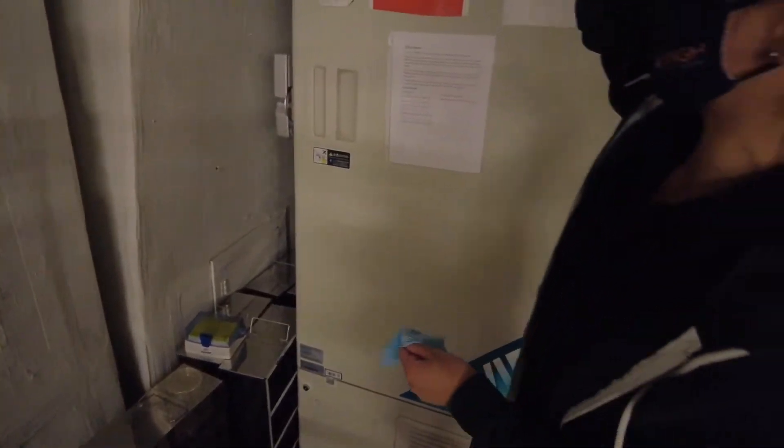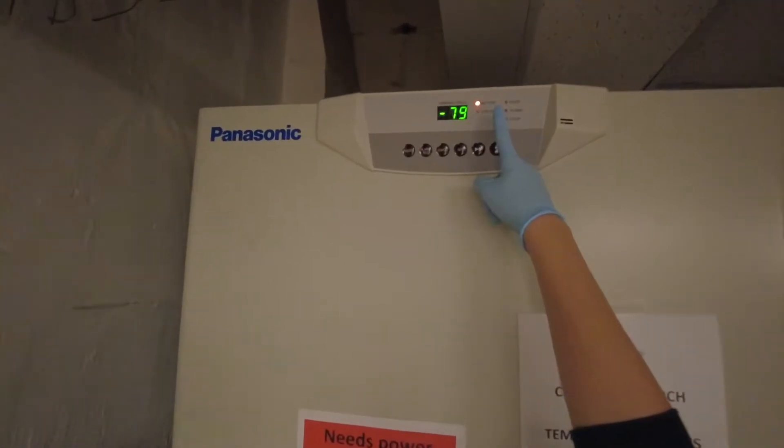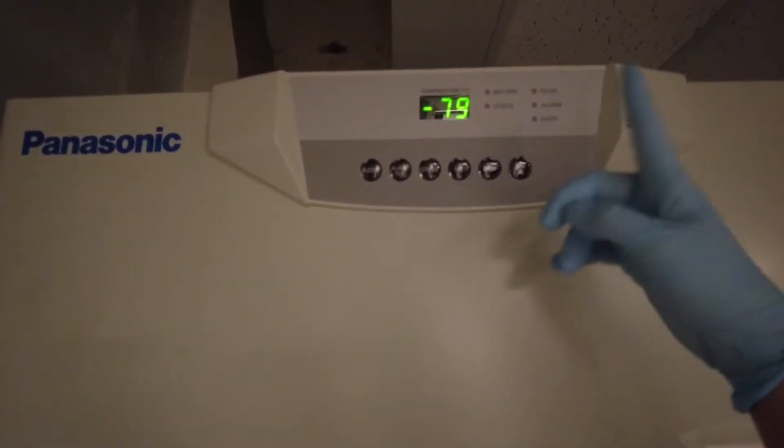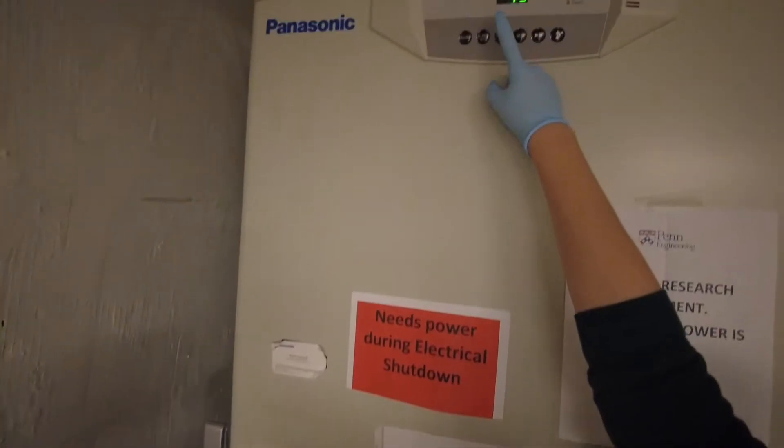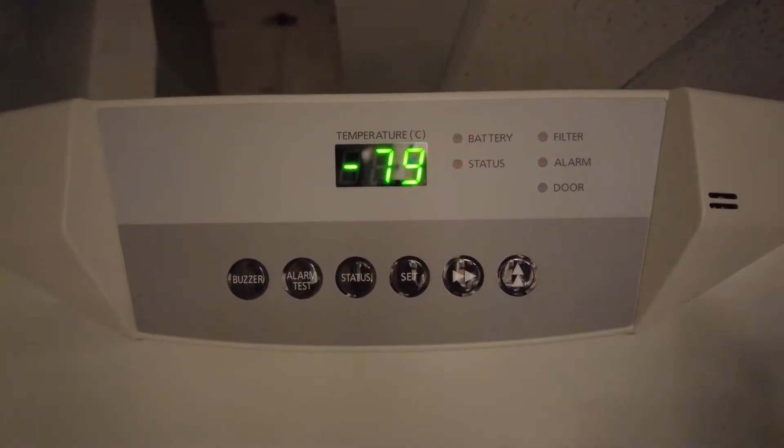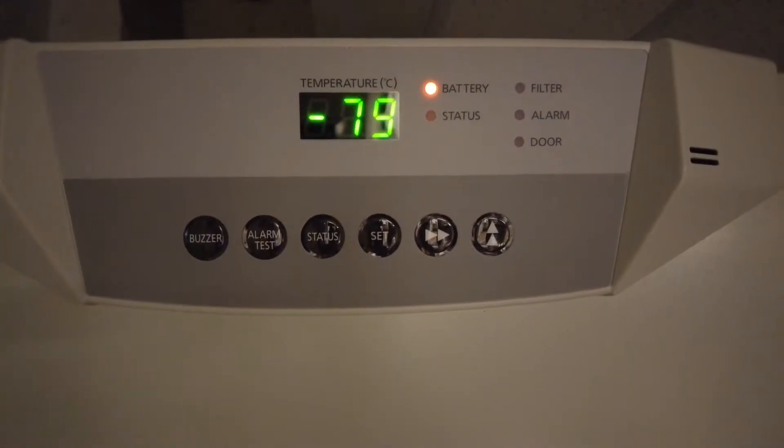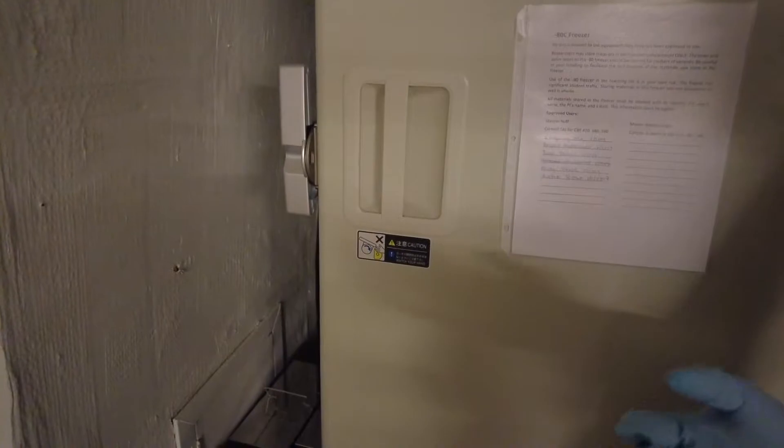This is the minus 80 freezer. The temperature indicator is here. It always has this battery light flashing, but it's not your responsibility to change the battery. But if it gets crazy, let someone know. Make sure this number is around minus 80. If it gets too high, like minus 60 or something, also let someone know. You want to have this thing open for as short amount of time as possible.